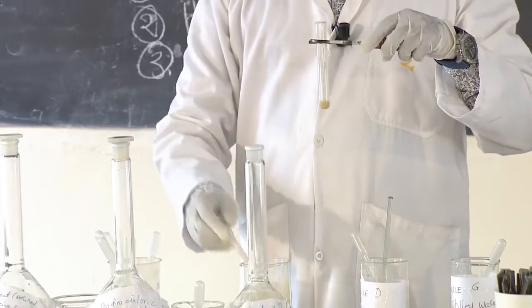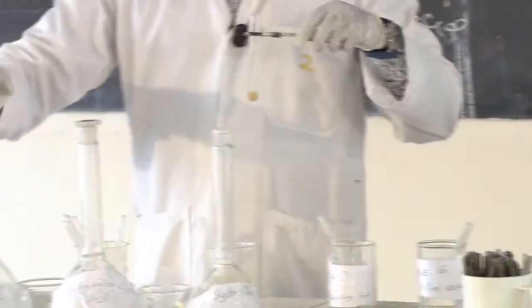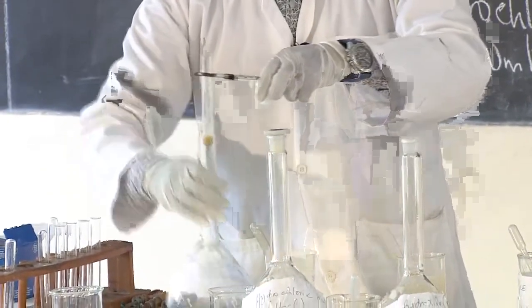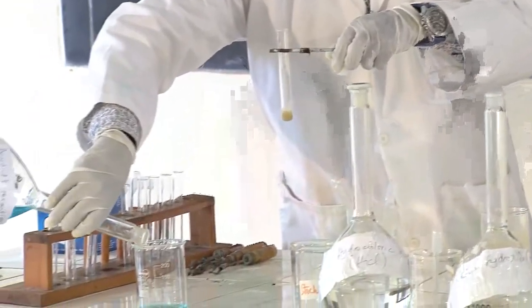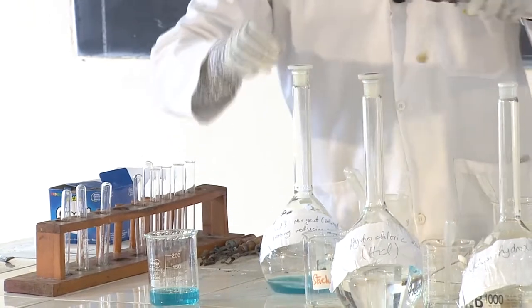Then from there, you add the Benedict's solution. This is the Benedict's solution. After adding it, you get a dropper.